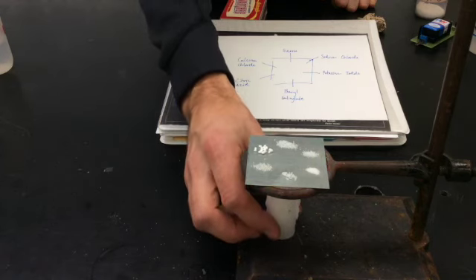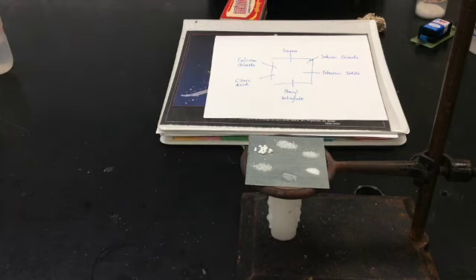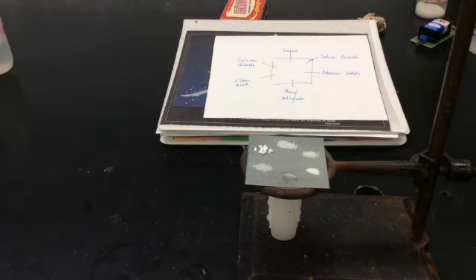Back underneath in the middle of our plate here. You can see our first compound to melt rather quickly is the phenyl salicylate. That must mean it has a very low melting point.